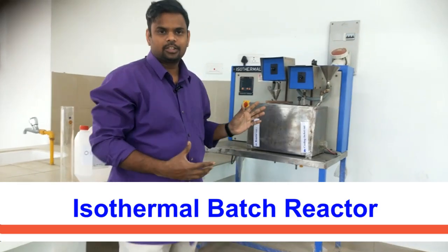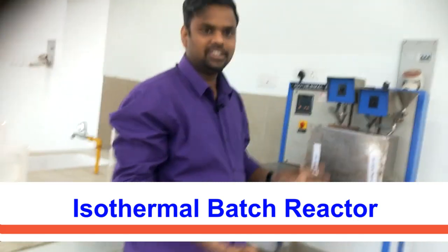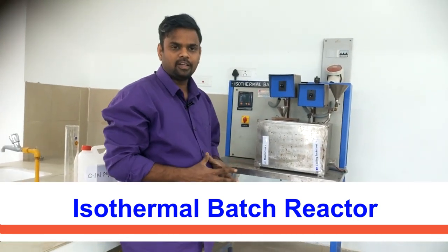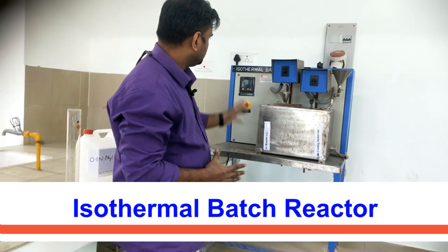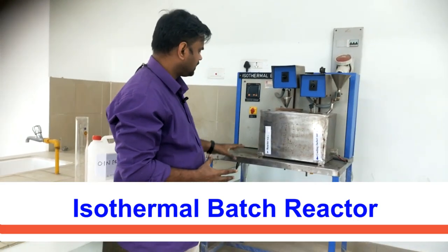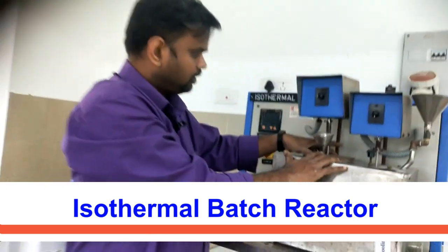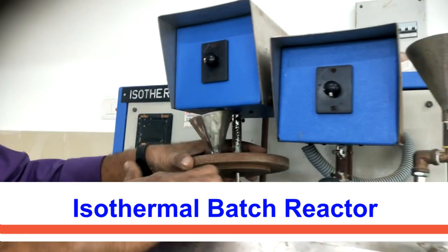So this is the experimental setup for an isothermal batch reactor. Isothermal means we are trying to maintain the temperature constant. This isothermal batch reactor contains a reaction vessel. We have a reaction vessel, you can see here.